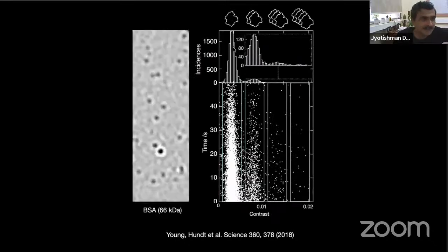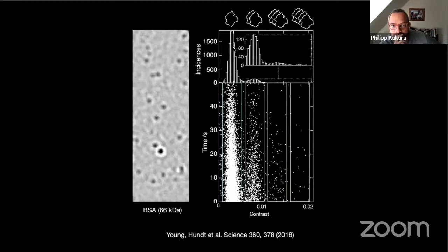And Phil, these two, yeah. Sorry, interrupting. These are in kilodaltons. You're showing the calibrations in kilodaltons. So a 2% change in a 200 kilodalton protein would be quite a bit, right? 4 kilodalton. 4 kilodalton. So we are off by at least 20 amino acids, right? Or 30 amino acids. Right.